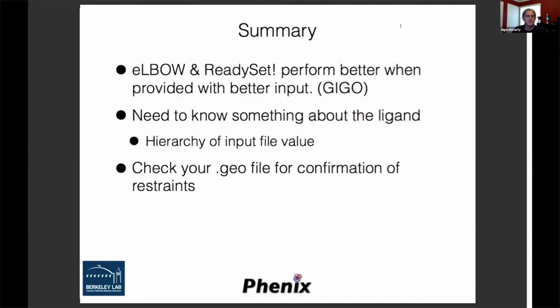Another question: what is the best way to covalently make an S linkage between a peptide and a lipid molecule? It depends on the situation. I alluded to it in my talk, but there are three ways to make a linkage.